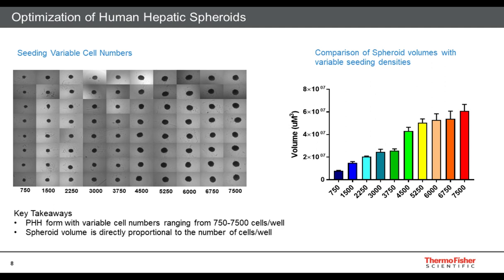Okay, so this slide is just going to walk through some of the basic parameters that we've done in our routine optimization across multiple lots, as we were trying to get the product and the protocol dialed in.